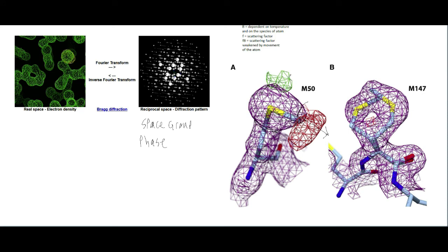And so what we would want to do is do a real space refinement and actually change the orientation of this atom here, and then we could compare that to our reciprocal space refinement, and that would end up telling us that this right here would probably end up being purple and this would go away.